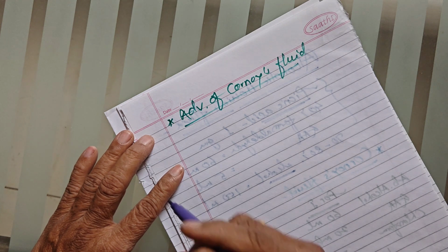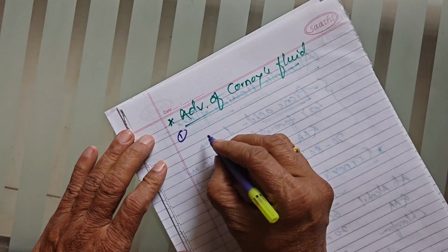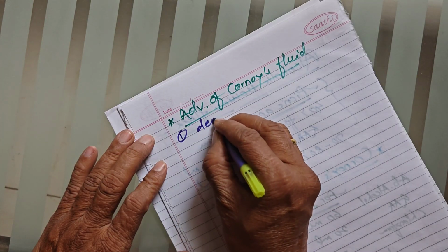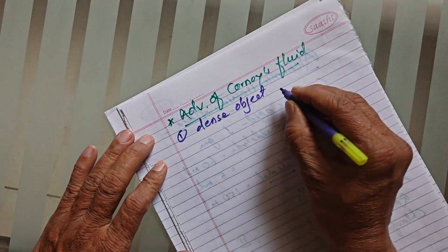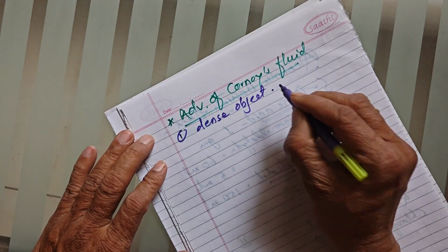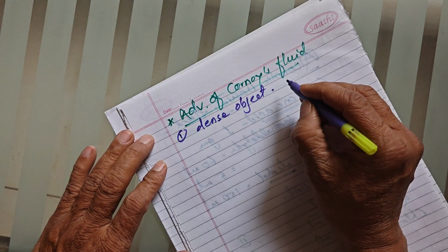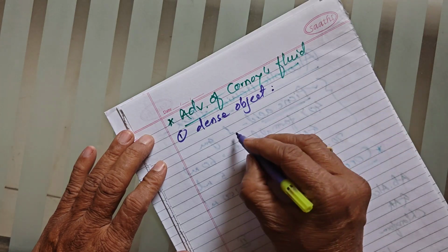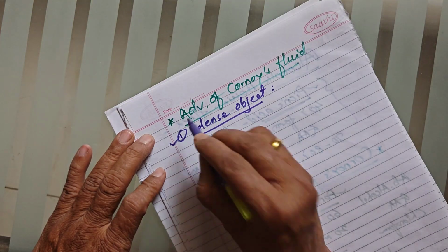The first advantage: Carnoy's fluid is used for dense objects, that is arthropod eggs, Ascaris eggs, nematode eggs, and all delicate eggs. For fixation of these dense objects, we use Carnoy's fluid.